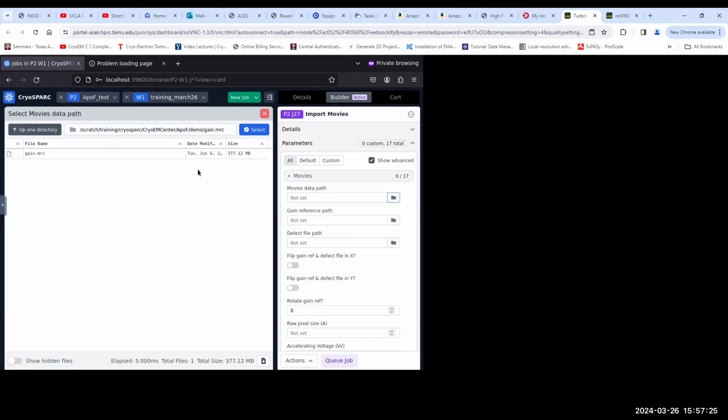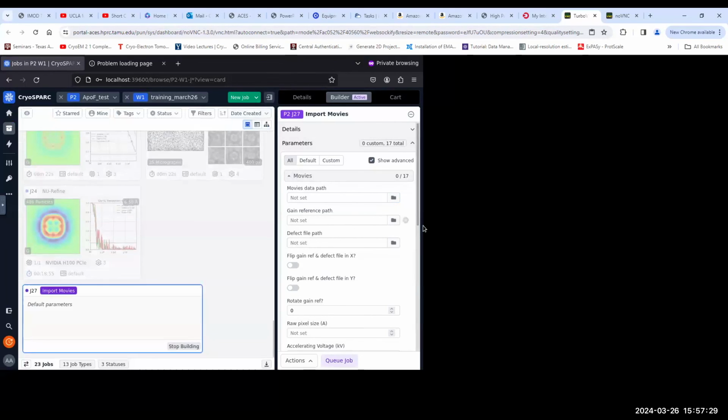Okay. And another question I had was, I don't know if we can do it in CryoSPARC or another software package, if we have picked particles, say for a phage base plate, and we want to just pick out a sub feature of that, is there a way to automatically process, say from the 2D classification step, where I want to section out this feature and it'll go back to the original images and just section out those features? And then do it again?